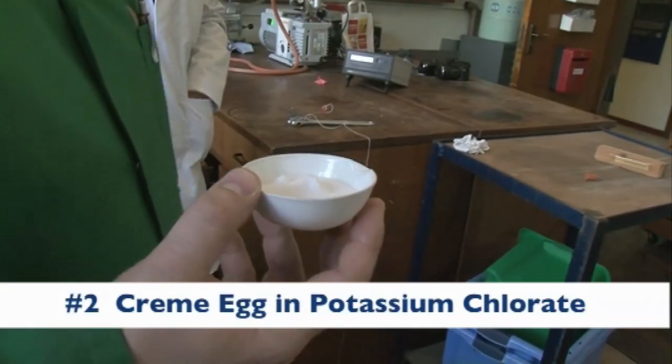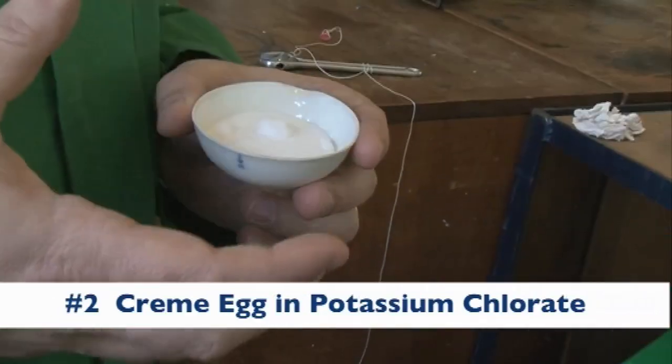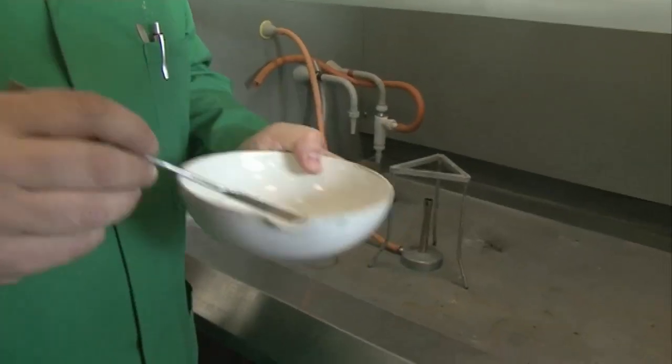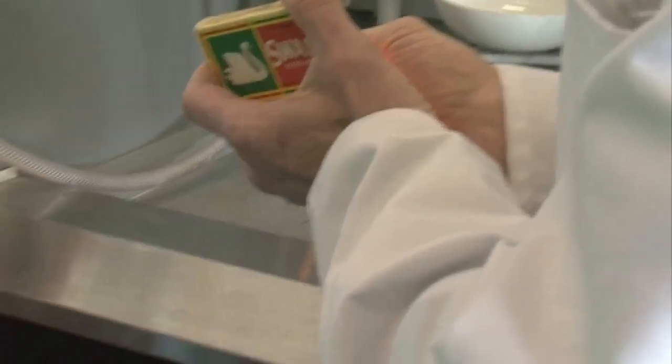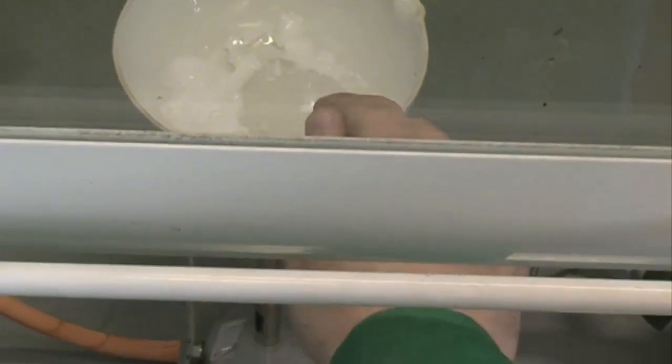So this is potassium chlorate. I call it bottled oxygen because it's a simple chemical, an inorganic material, which contains lots of oxygen. So when you heat it, it gives up all that oxygen and then it can react. We've broken up the lumps, now we need to fuse it. So to fuse the salt, we have to melt it. And you can see we have a Bunsen burner — the salt is starting to melt. It's fusing.